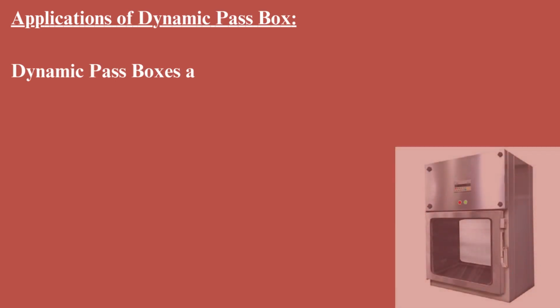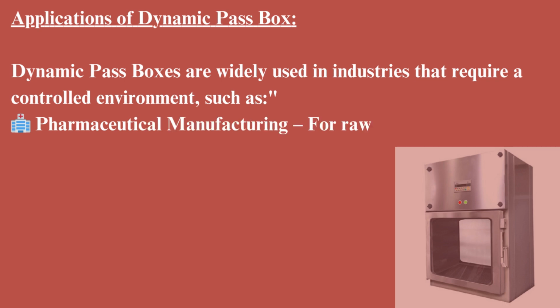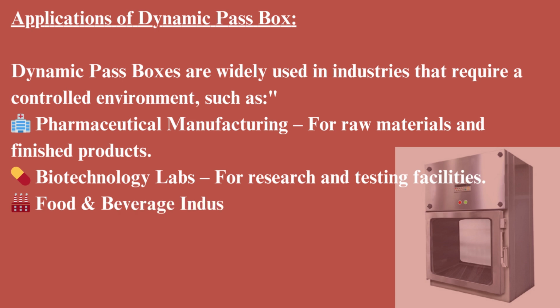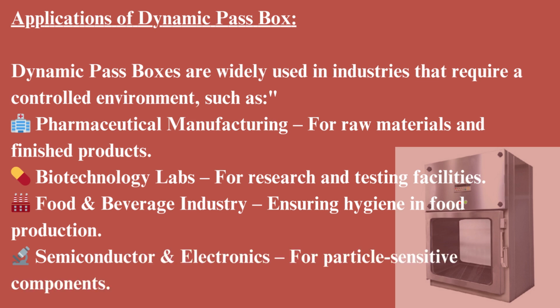Applications of dynamic passbox. Dynamic passboxes are widely used in industries that require a controlled environment, such as pharmaceutical manufacturing, for raw materials and finished products, biotechnology labs, for research and testing facilities, food beverage industry, ensuring hygiene in food production, semiconductor electronics, for particle-sensitive components.